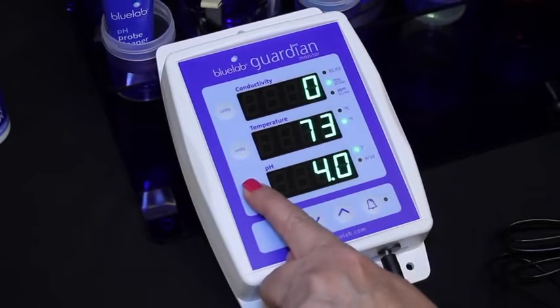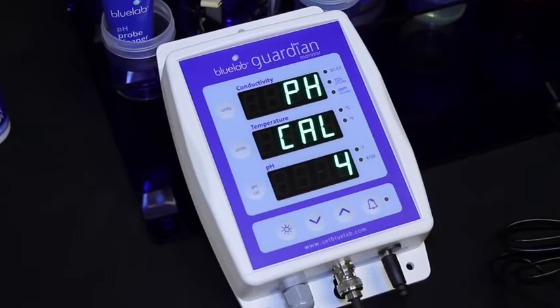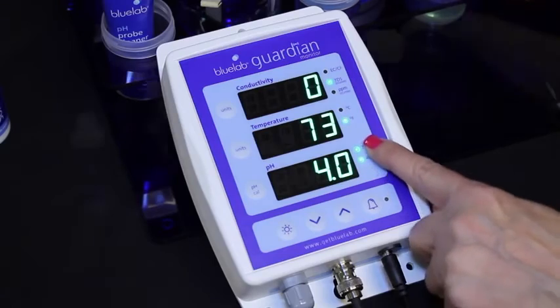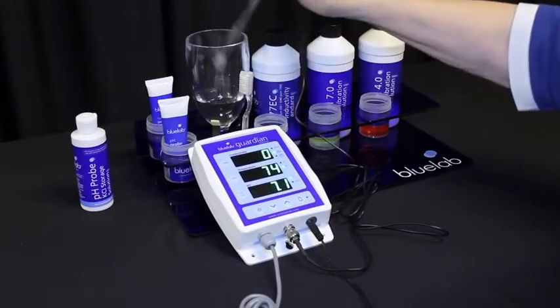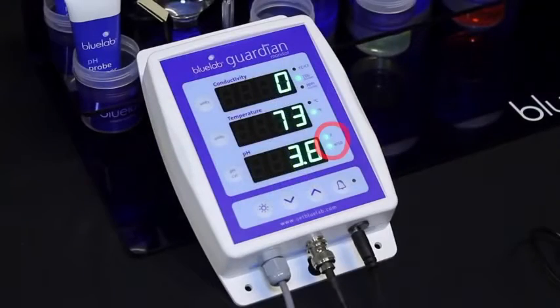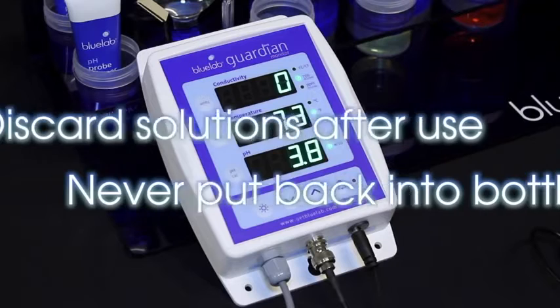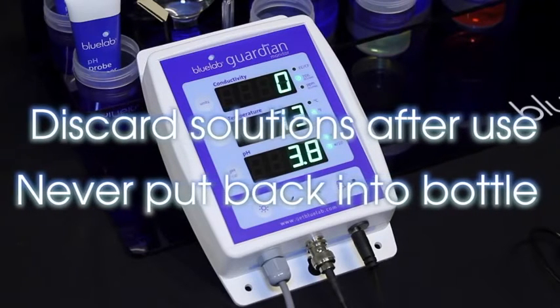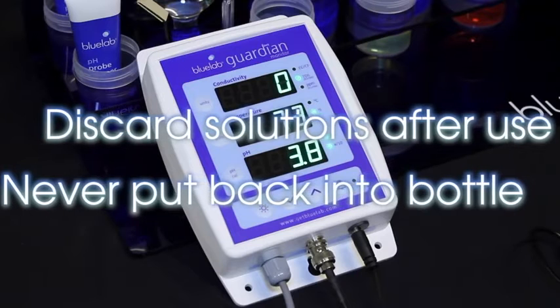Press and hold the pH cal button until pH and cal appear, then release. 4 will flash on the pH display, then the pH 4.0 indicator light will glow. Rinse the probe in clean tap water. You'll have successfully calibrated when you see both calibration indicator lights glowing. Discard all used solution after calibration — never put them back into the bottle as you will contaminate the solution.